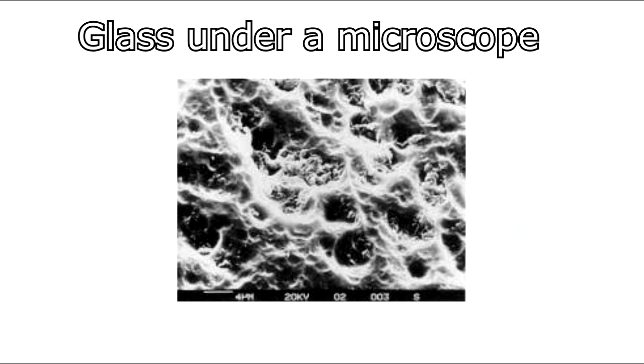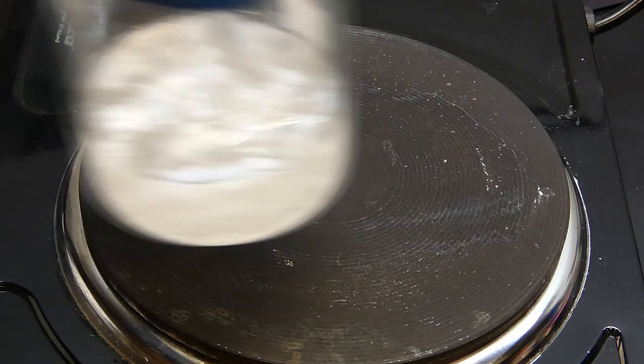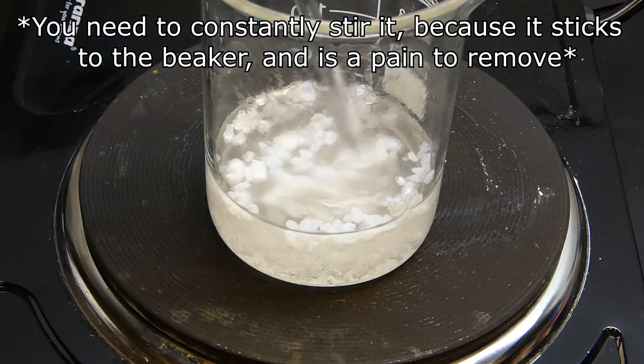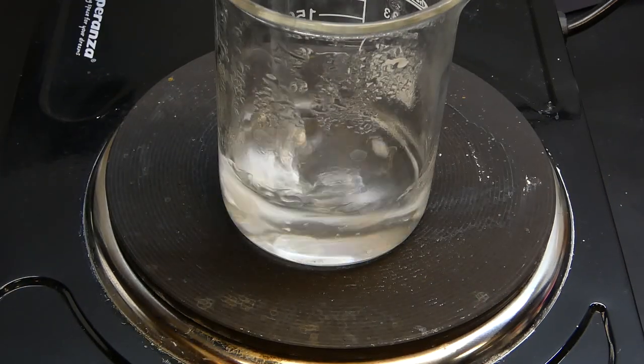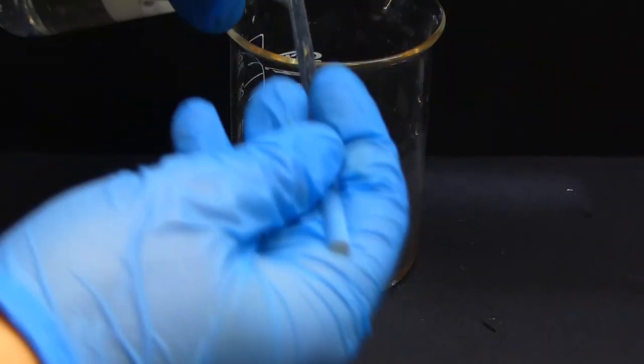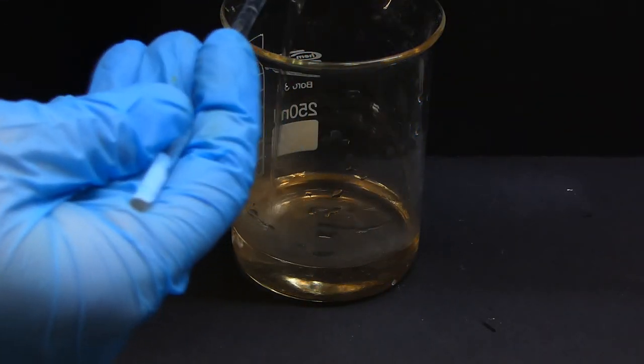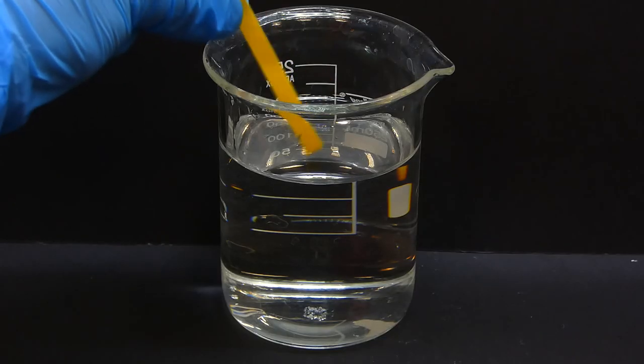But the glass is also a silicon dioxide, so why doesn't this reaction eat my beakers? Well, a beaker is composed of a very firm and densely packed form of silicon dioxide. The silica gel is like a very porous sponge, which has microscopic holes that allow you to absorb tons of water and making its surface area very high. After heating the mixture to speed up the process, there were some unreacted silica gel pieces. But I just filtered them and was left with a very concentrated and thick solution of sodium silicate, which was also very basic because of all of the unreacted sodium hydroxide.